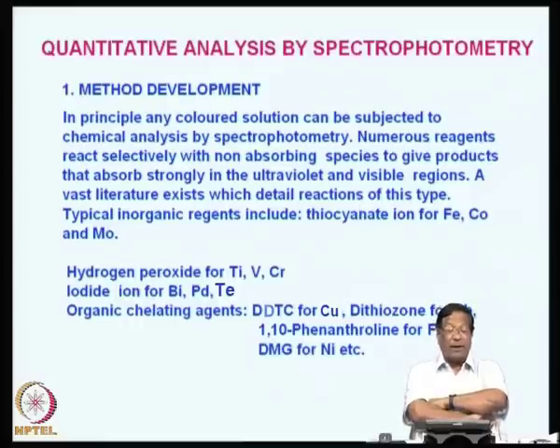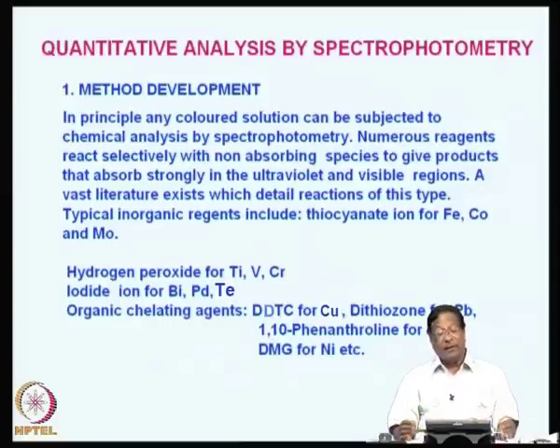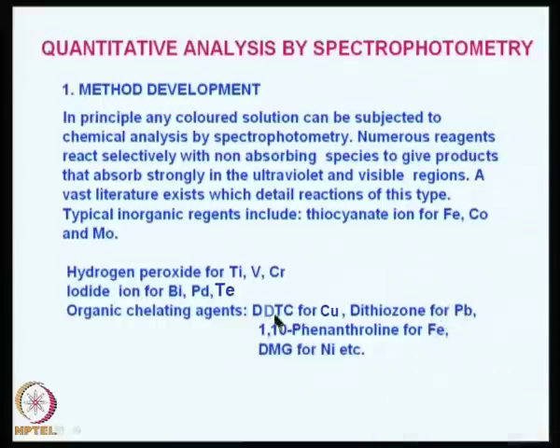Typically, reactive inorganic reagents include thiocyanate ion for iron, cobalt, molybdenum, etcetera. You can use hydrogen peroxide for titanium, vanadium, chromium, iodide ion for bismuth, palladium, tellurium, etcetera, and a number of organic reagents, chelating agents: diethyl dithiocarbamate for copper, dithizone for lead, 1,10-phenanthroline for iron, dimethylglyoxime for nickel, etcetera.